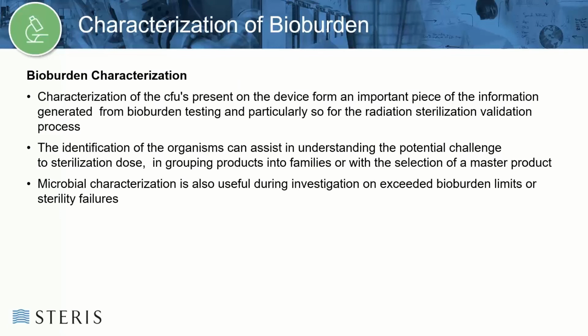Why would we carry out bioburden characterization? Characterization of CFUs present on the device forms an important piece of the information generated from bioburden testing, and particularly for the radiation sterilization validation process.